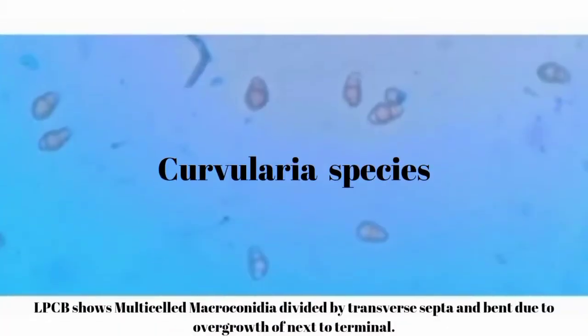Next one is Curvularia species. Macroconidia of Curvularia species are easy to recognize, having 4 to 5 cells which are separated by transverse septa. Curvularia species is an important cause of phaeohyphomycosis.